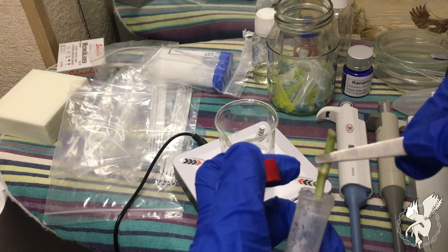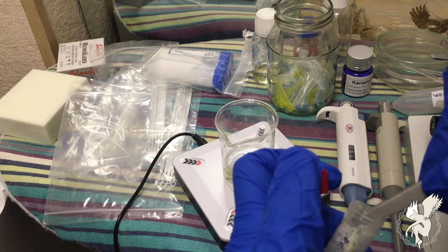Now put your sterile explants into the multiplication media, and you're basically done.